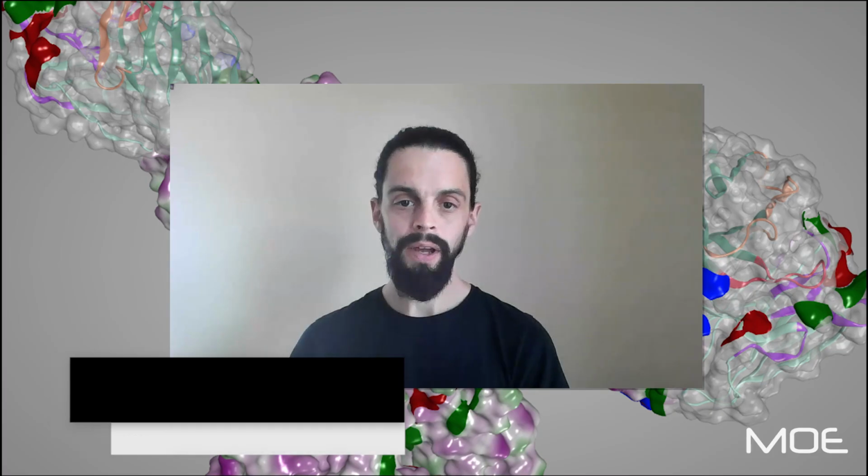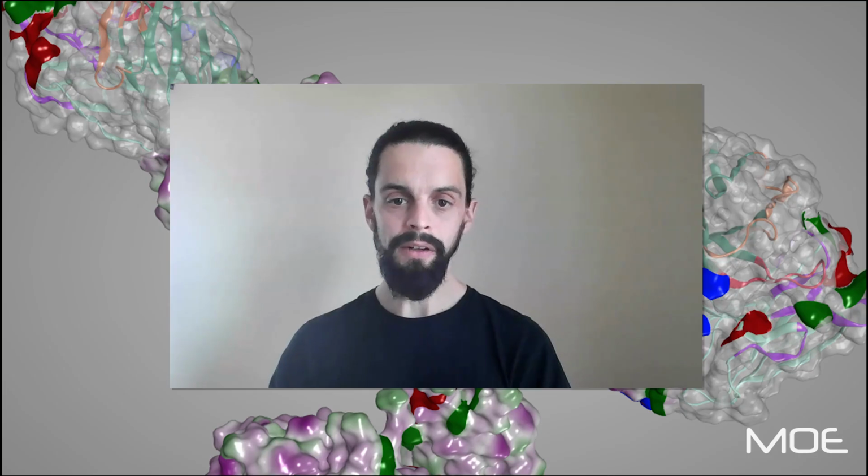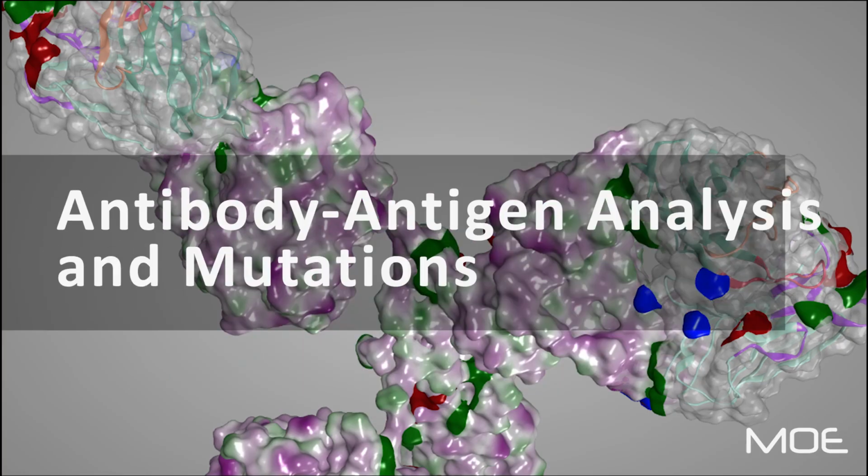Today I'd like to show you how to analyze a protein-protein complex. We'll do that by looking at protein contacts, properties, and patches, and then I'll show you how we can use that information to perform virtual mutagenesis and improve the overall properties of our protein. So let's get started.